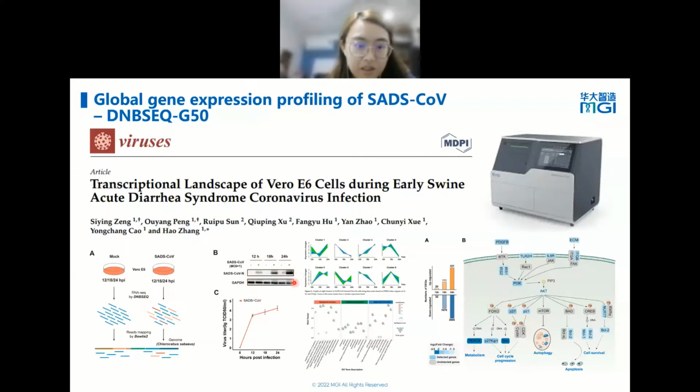This is a Western blot showing the expression at different time points in the negative and positive samples. You can see that the virus is not present in the negative samples, and then it slowly increases in load as time goes by.